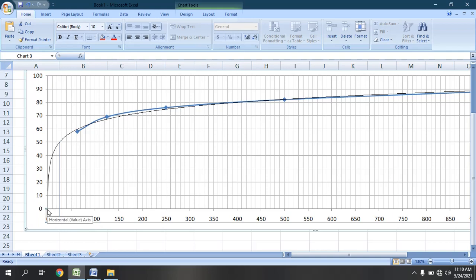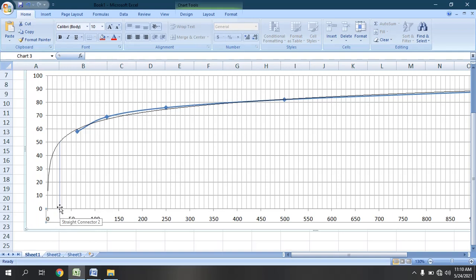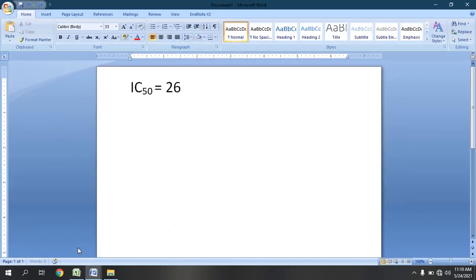Now we will calculate this point by counting divisions. This is the division of 10, this is 20, 30, 40 and 50. So this line is intersecting in between 20 and 30 — but not exactly in the middle. It is intersecting somewhat near to 30. So we will assume this is 26. We are going to put the IC50 value as 26 ppm.